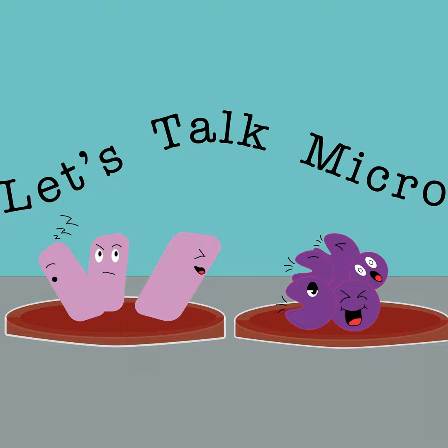Some of the species are serious. For example, Neisseria gonorrhea can have legal implications such as abuse. So we have to make sure that we do produce a good ID. It tends to be an unreliable test, so you want to make sure that you don't identify the wrong species of Neisseria. So what other tests can we use then?